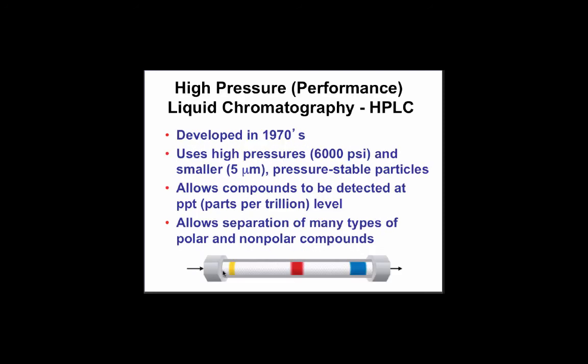So the pressure technique is perhaps the most useful method for accelerating chromatography. It's also a way, in many cases, of actually improving the resolution of chromatography. So high pressure or high performance liquid chromatography, HPLC, is the standard that's used in many metabolomics applications. So the field is old. It's getting on to 40-odd years.